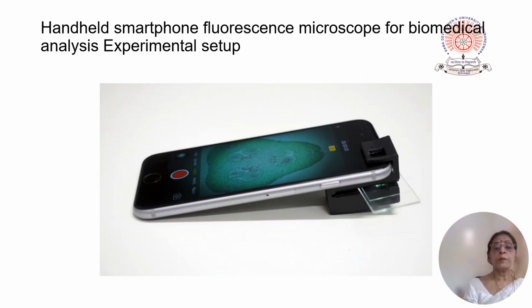This is the experimental setup that shows a smartphone converted to a fluorescence microscope. If it is successful, it can be very useful for biomedical analysis.